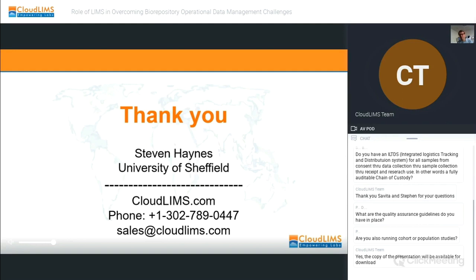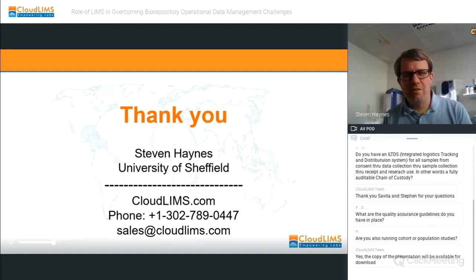Sorry. So yeah, this is a company called Tutela Medical. So we have the Tutela system installed, and they come and service the probes, and it's linked to a wireless internet connection. Yeah, so they have a center that monitors the freezer temperatures, and they phone with an alert if a freezer goes down.